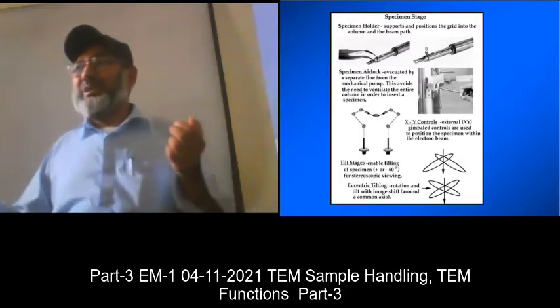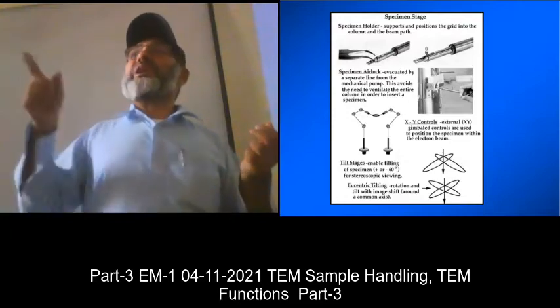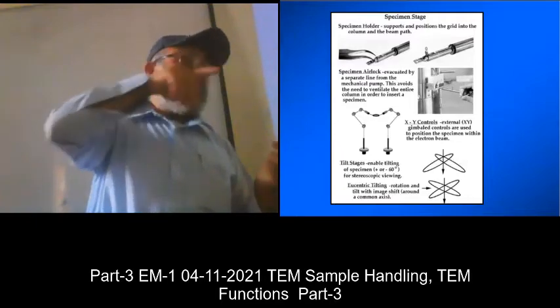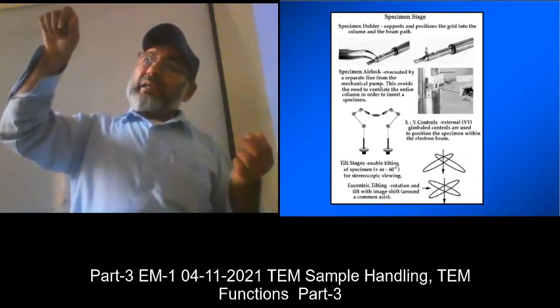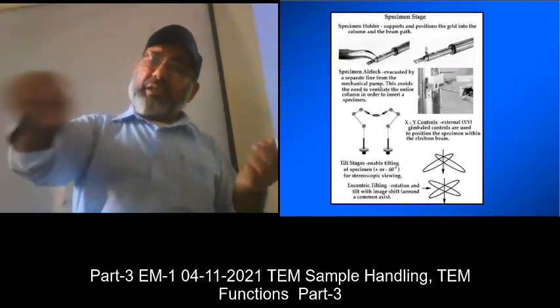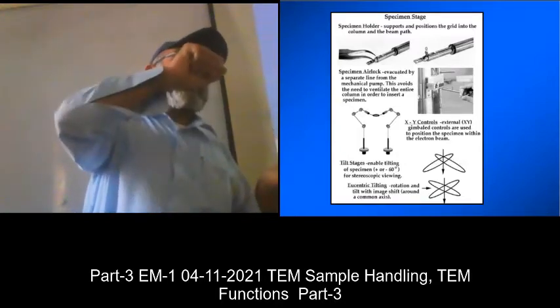So, when the sample is very, very thin and very, very brittle, and I am not sure whether it will be safe if I hold it with the tweezer, then there used to be a vacuum tweezer. Vacuum tweezer is pulling back the air, and there is a spot there. When you open it, it holds the side of the sample, then you lock it.